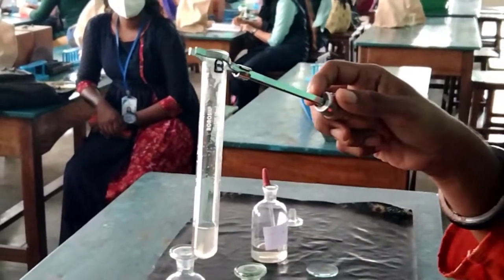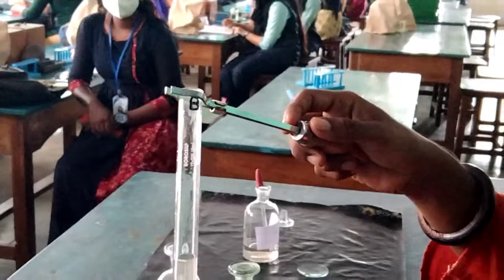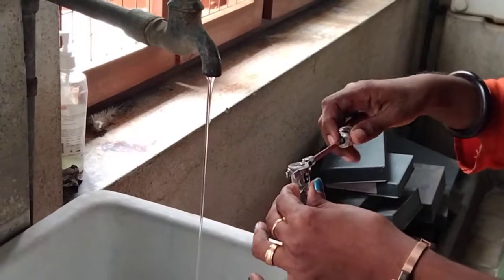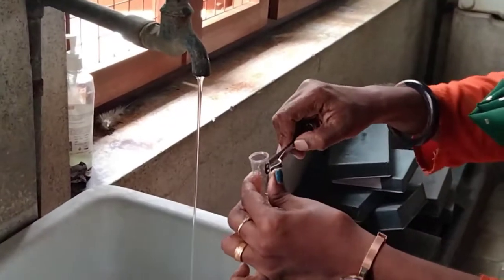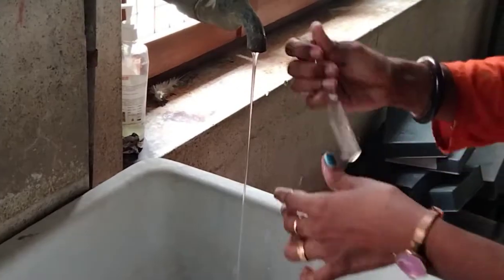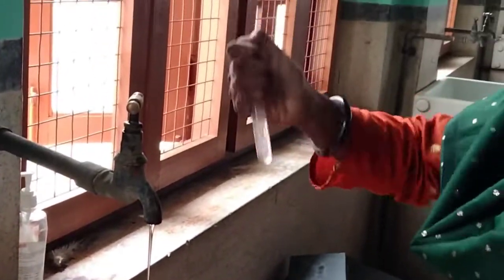Now you have to wash this properly and then strain it. The scales will have dirt in them, so you have to wash it. And all the KOH should be removed by washing.